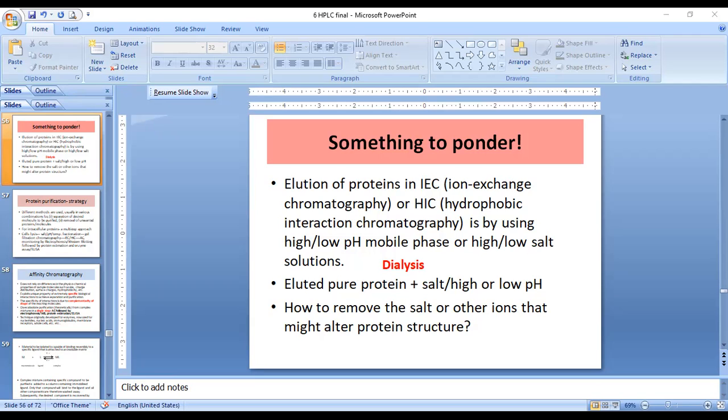And therefore, you remove that dialysis bag and keep it in another fresh distilled water. When you put it in the fresh distilled water, whatever salts are there inside will also come out from that bag. So we have to continue this for some time. Repeatedly, we keep that dialysis bag in fresh distilled water, so that whatever ions are there inside will come out of that sample component. Is that clear to everybody?